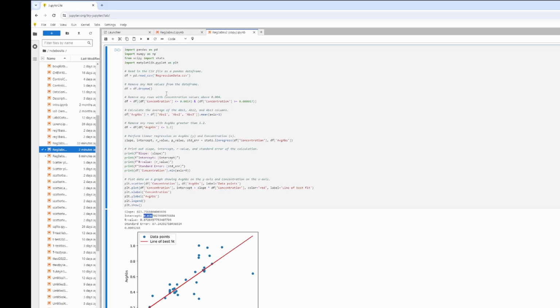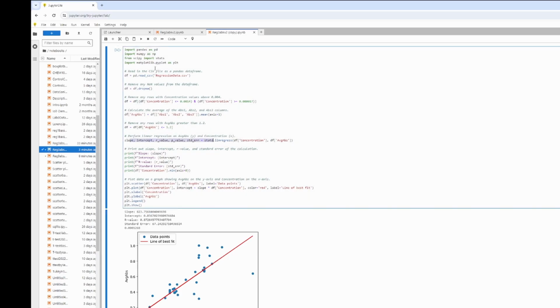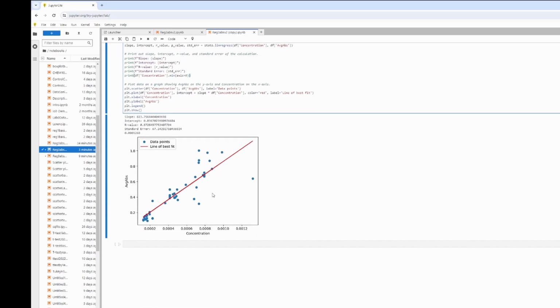And now, because we pruned all this data, we can now do the linear regression. So we're using the SciPy stats to do a linear regression based on concentration and absorbance that we've pruned here. And so there's our X, there's our Y. And now we can print out, after this calculation, the slope, the intercept, the R value. We also did the standard error. I didn't do the P value. And here I'm printing out the minimum again. So we can remove this because it's not worth our value anymore. You can remove it, and that's it. So we've essentially defined everything.